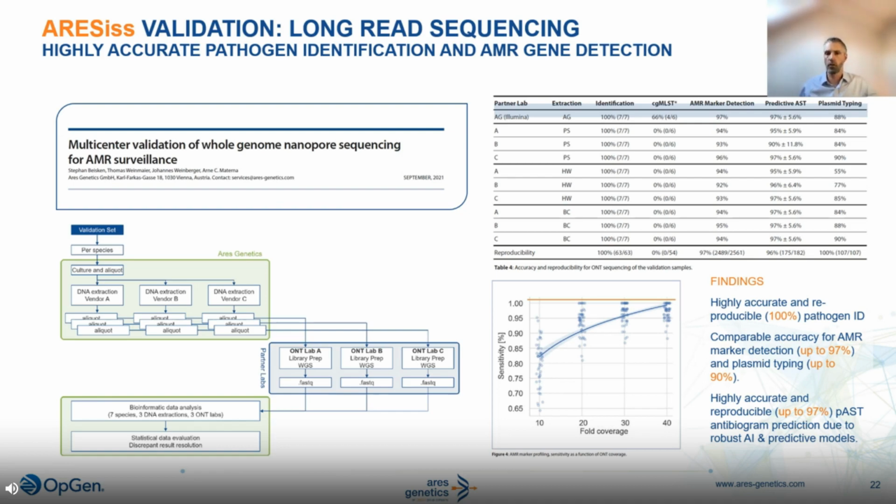The only area where the Nanopore technology needs to improve further is bacterial typing using core genome MLST, as the involved bioinformatics are more sensitive to sequencing error. We have enrolled with ONT in the so-called Q20 program, the Q20 chemistry early access program, which is promising drastic quality increases. The first test runs using the new chemistry, also for core genome MLST typing, look promising, but further testing is required at this point.